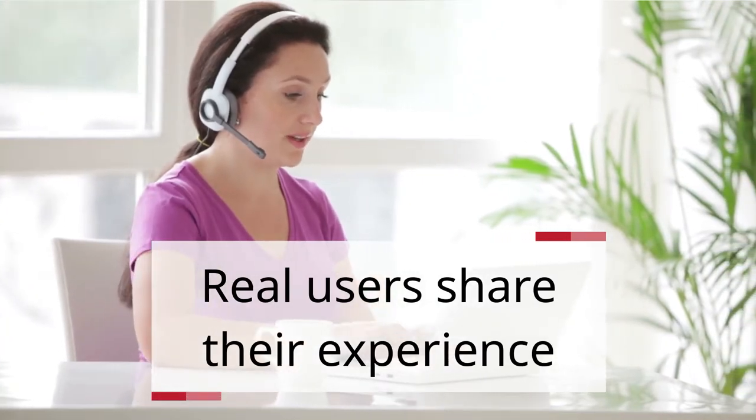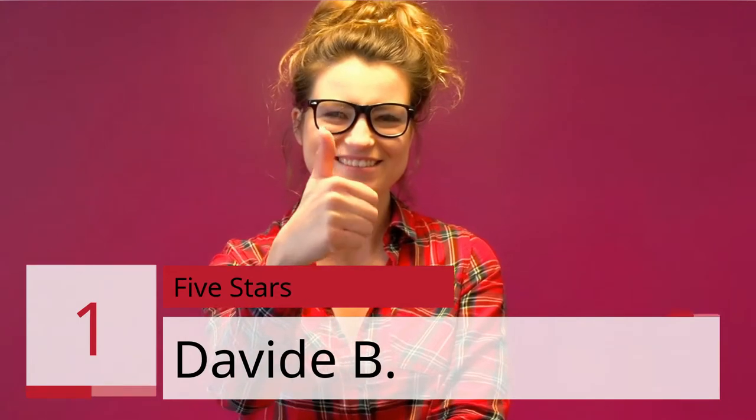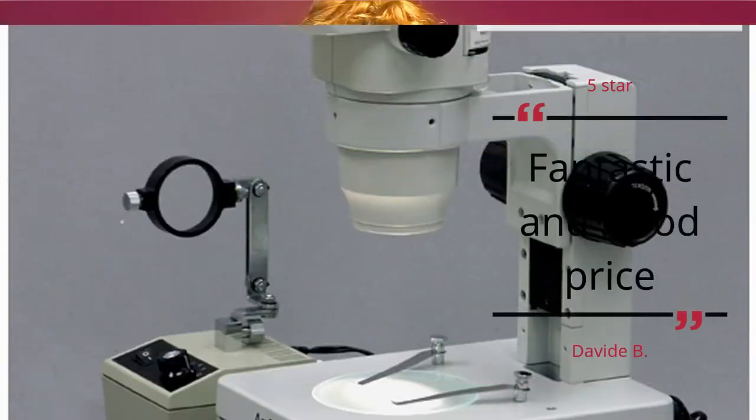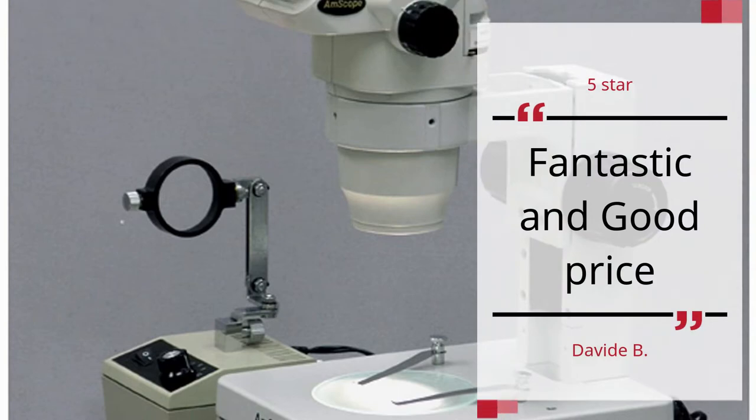Real users share their experience. Number 1: 5 stars. Davide B gives 5 stars — Fantastic and good price.